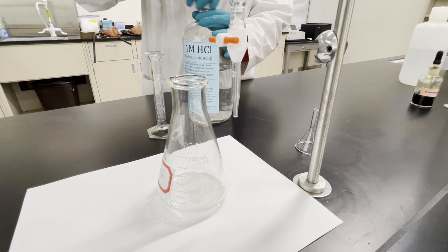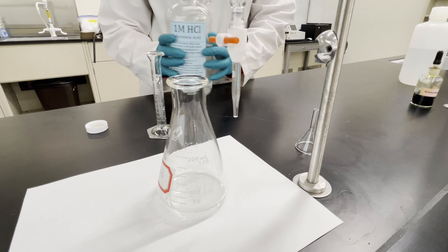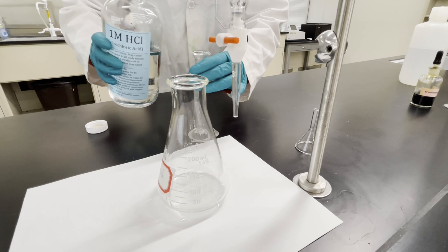So first I'm going to start by adding some acid to our Erlenmeyer flask. This will be our known amount, so I'm going to put 10 milliliters in using this graduated cylinder.